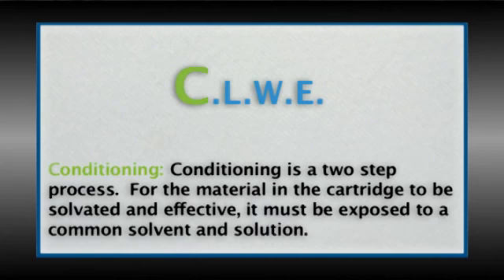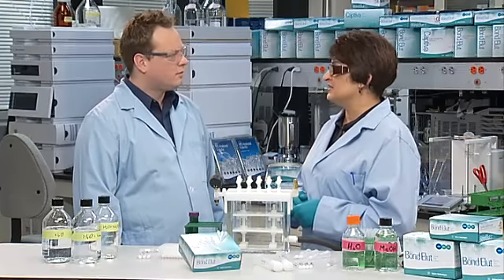Conditioning is usually a 2-step process, often ignored or minimized. So let's take a moment to discuss why conditioning is a truly important step in the SPE process. The issue of conditioning applies to both polymers and silica-based SPE materials, but it is critical for silica-based products. For polymeric SPE materials, conditioning improves flow. Ben, what are your thoughts about conditioning?